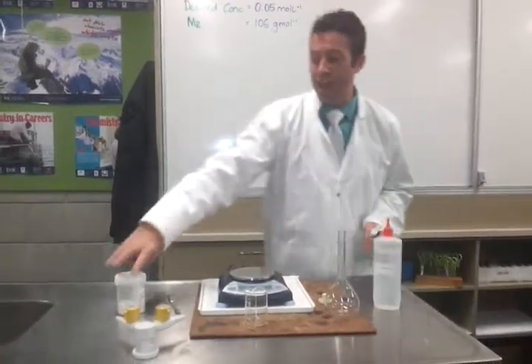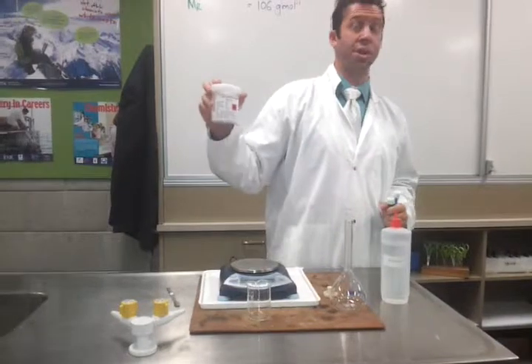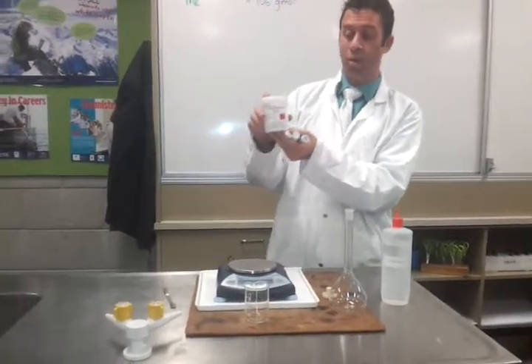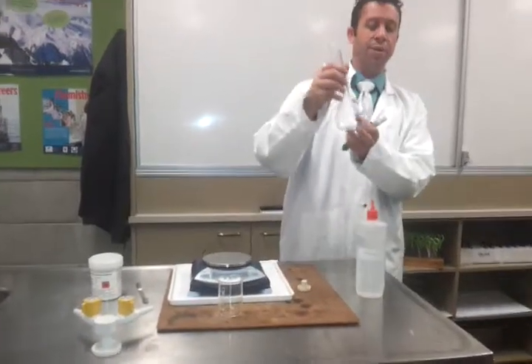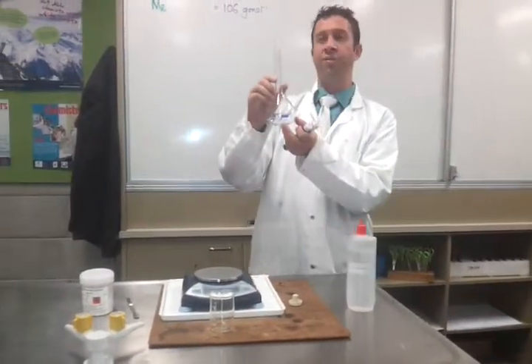Well, to do that, we have to get a mass of our anhydrous salt, so it's had all the water of crystallisation boiled out of it. We're going to have to get a mass of that to dissolve into a particular volume. And you're going to make 250 mils.